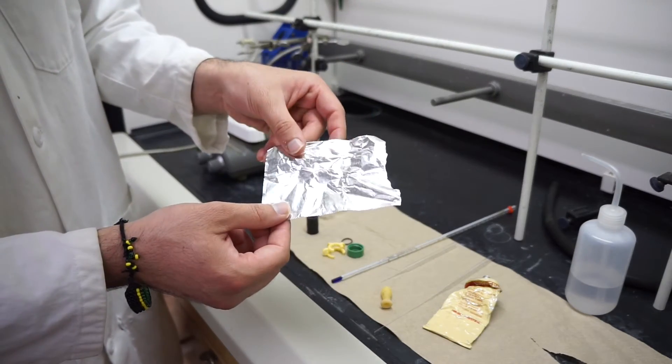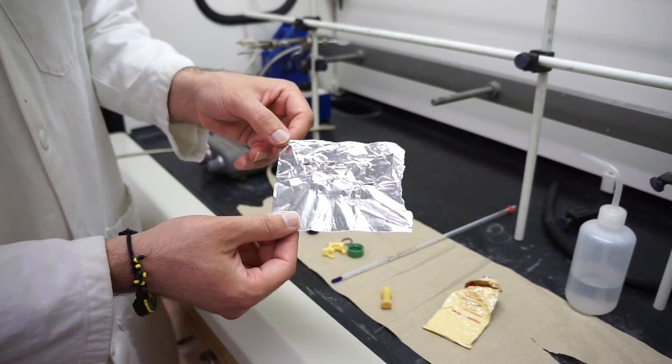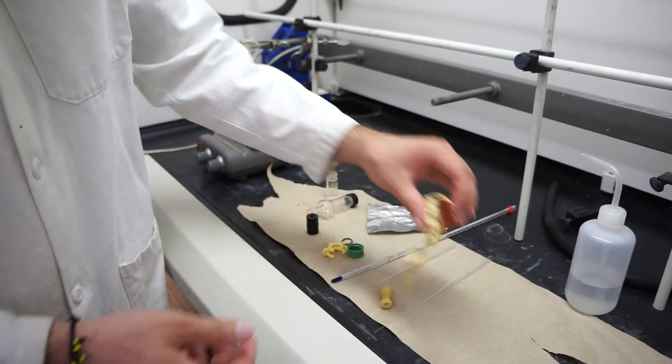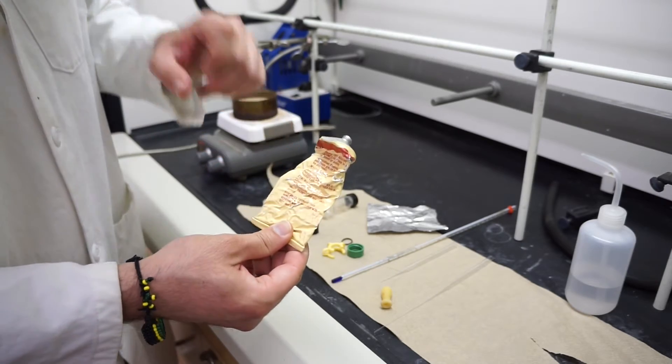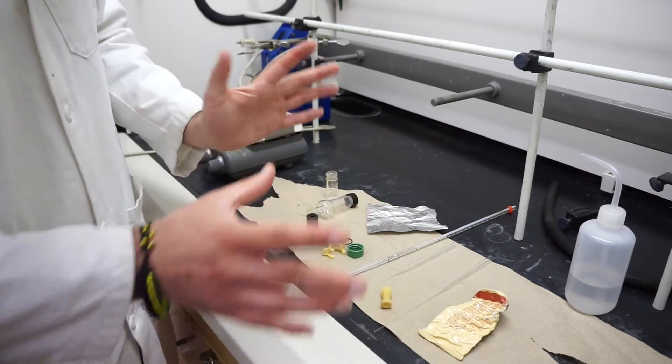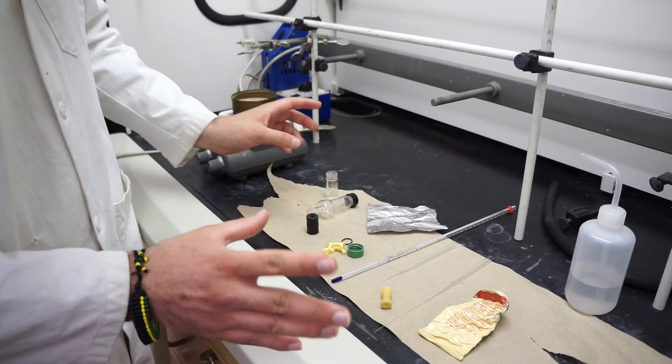Aluminum foil will definitely help you out. You only need a small piece about this big, and then some vacuum grease. Your vacuum grease may be in a syringe that says grease on it. This is the equipment we're going to need today.